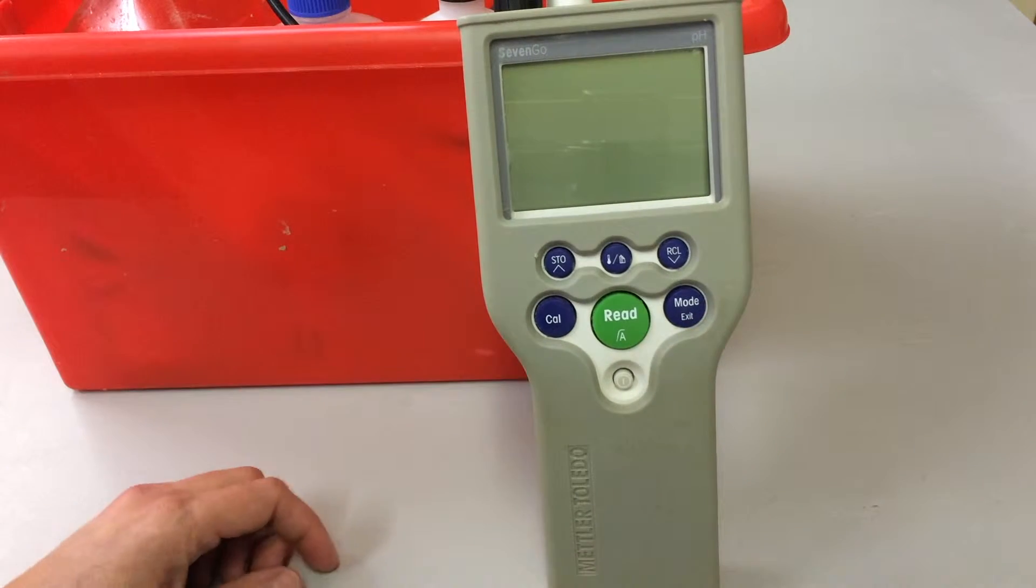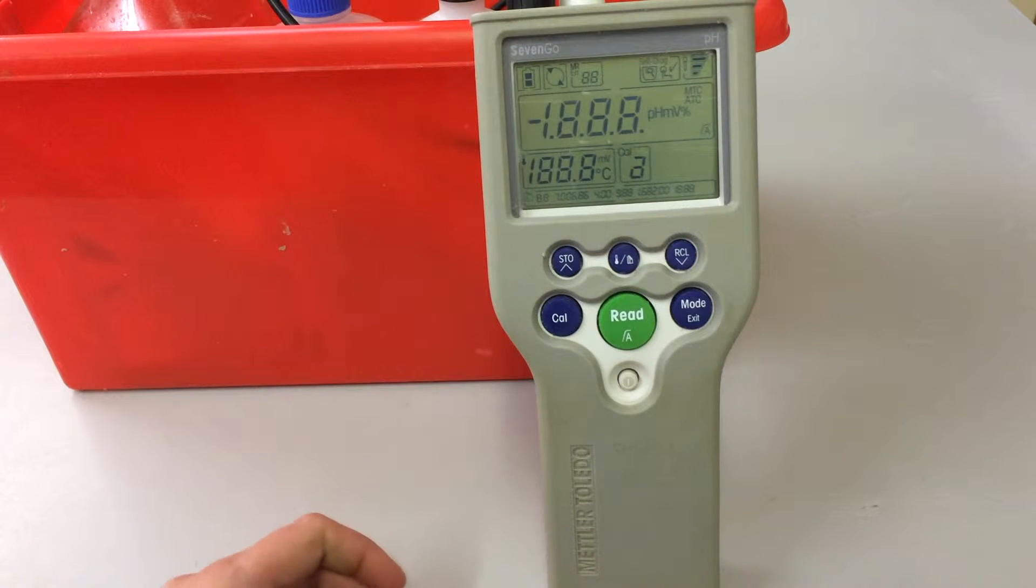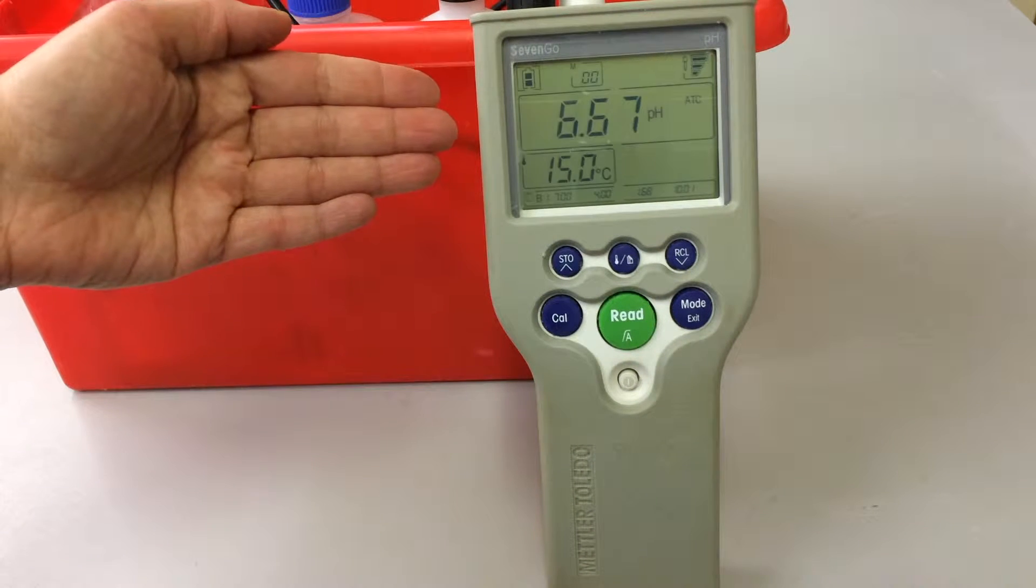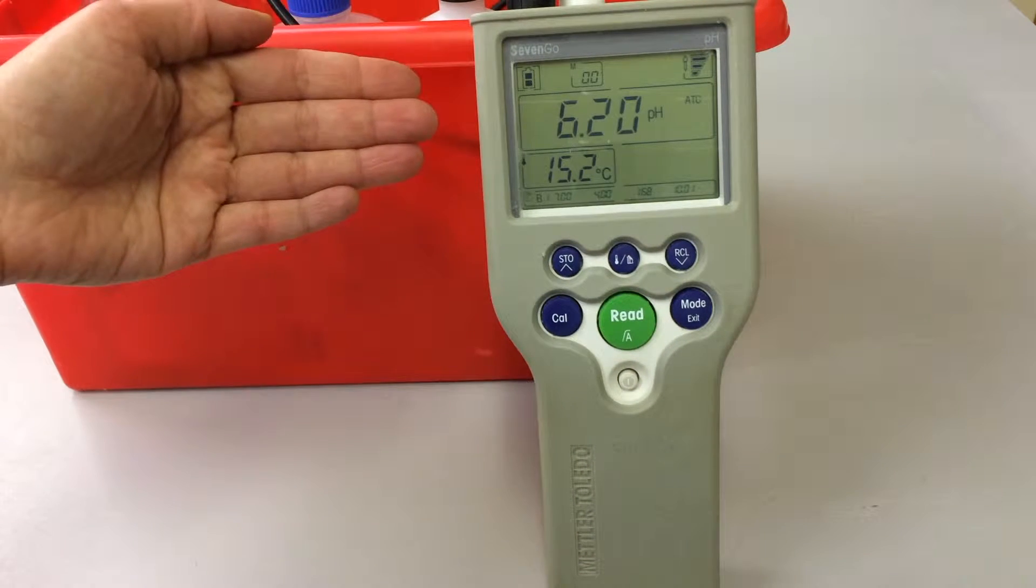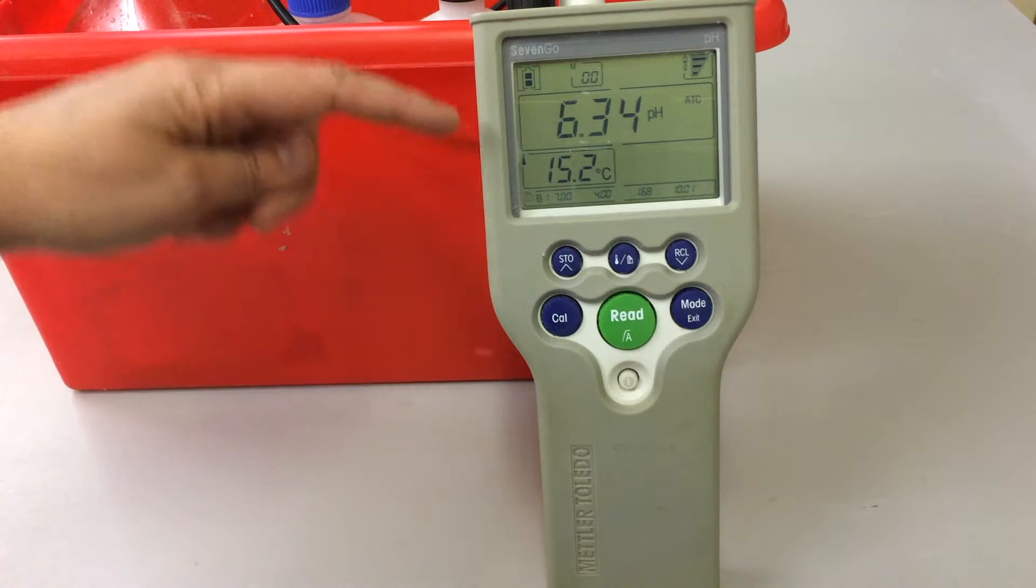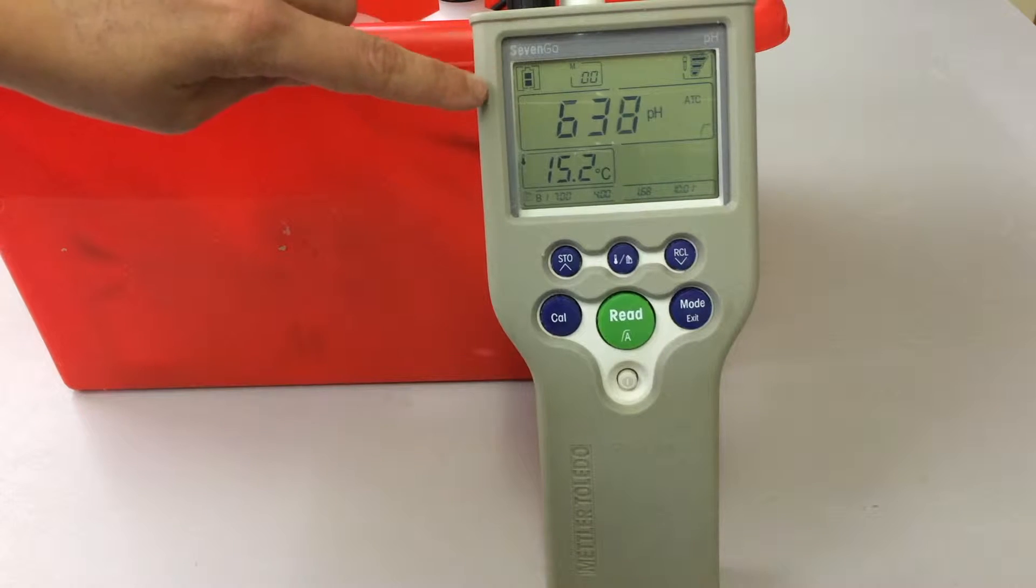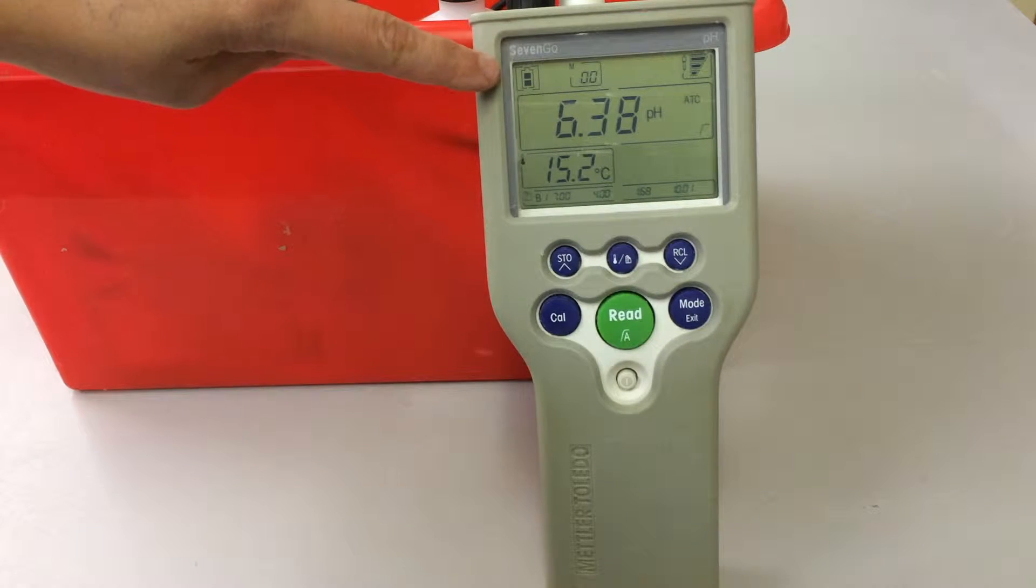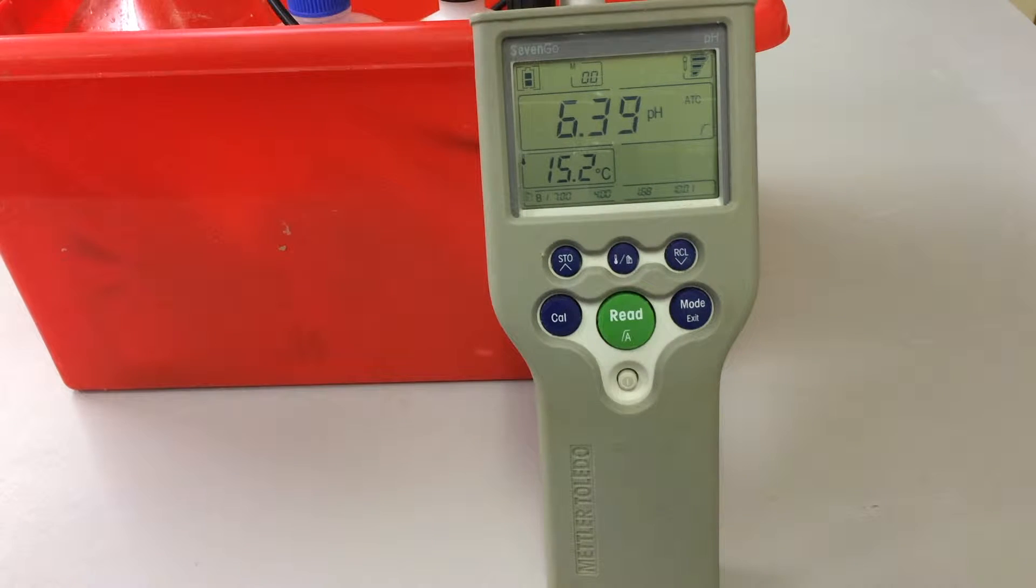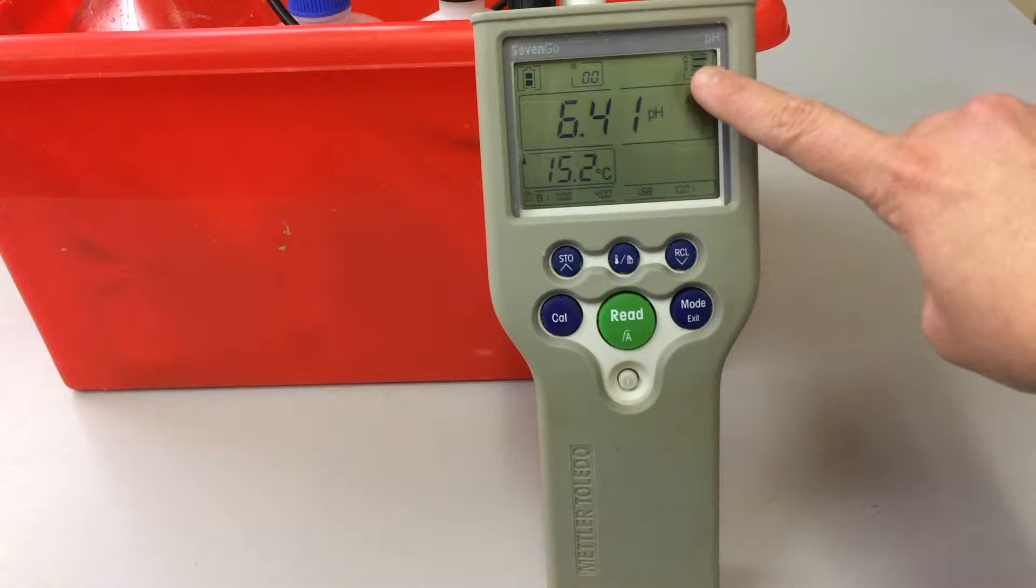To switch the piece of kit on, you press this white button here and then you'll see that the display starts booting up and we get various items on display here. On the top left hand corner we have the battery life. We've got two dark bars there indicating that there's a very full battery in there.